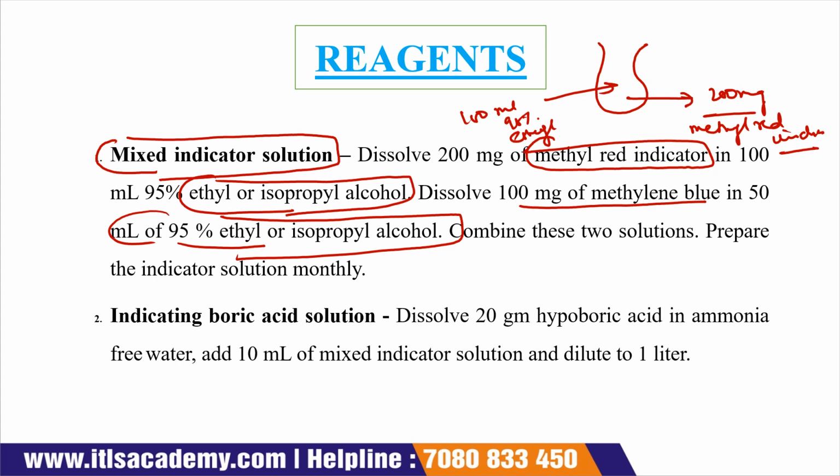Now we mix these two solutions, and by mixing these two solutions, the indicator solution is prepared, and this solution is prepared monthly.